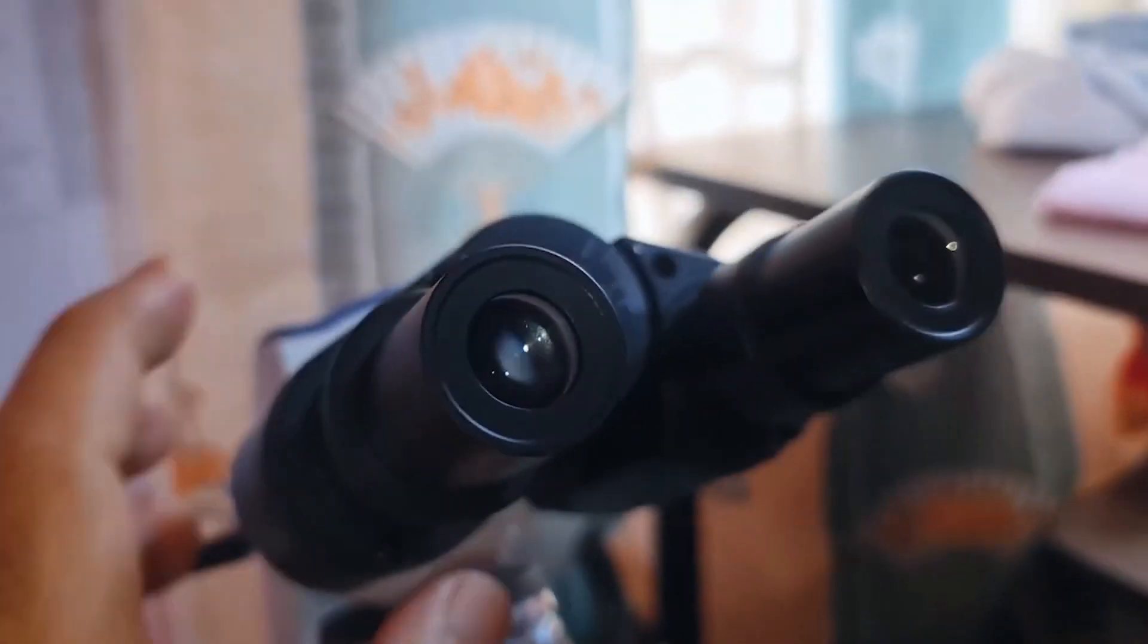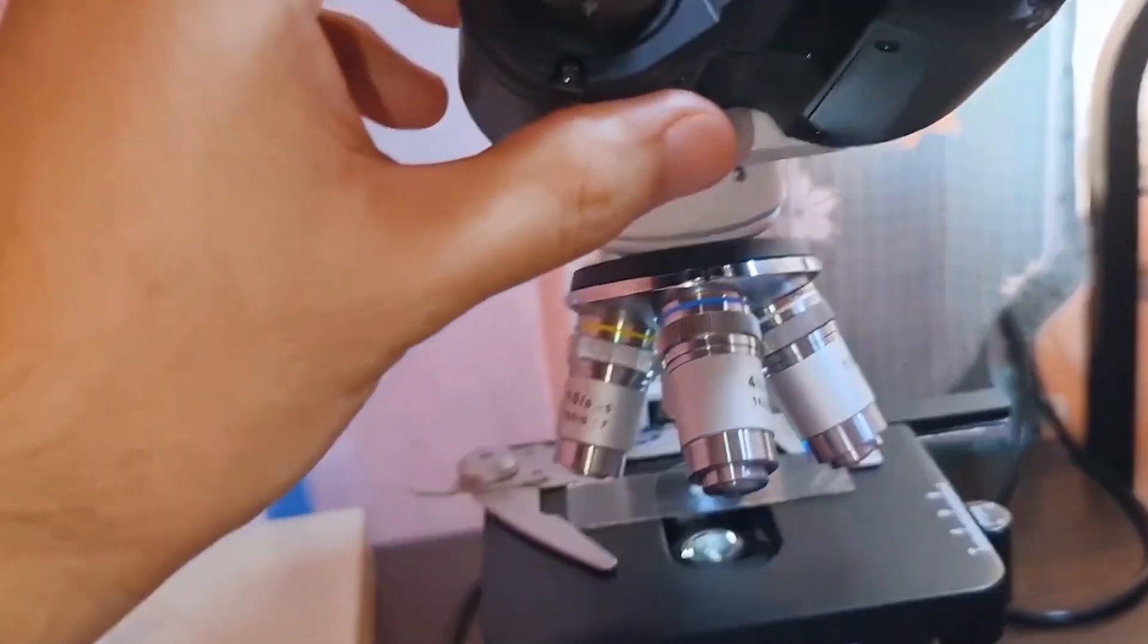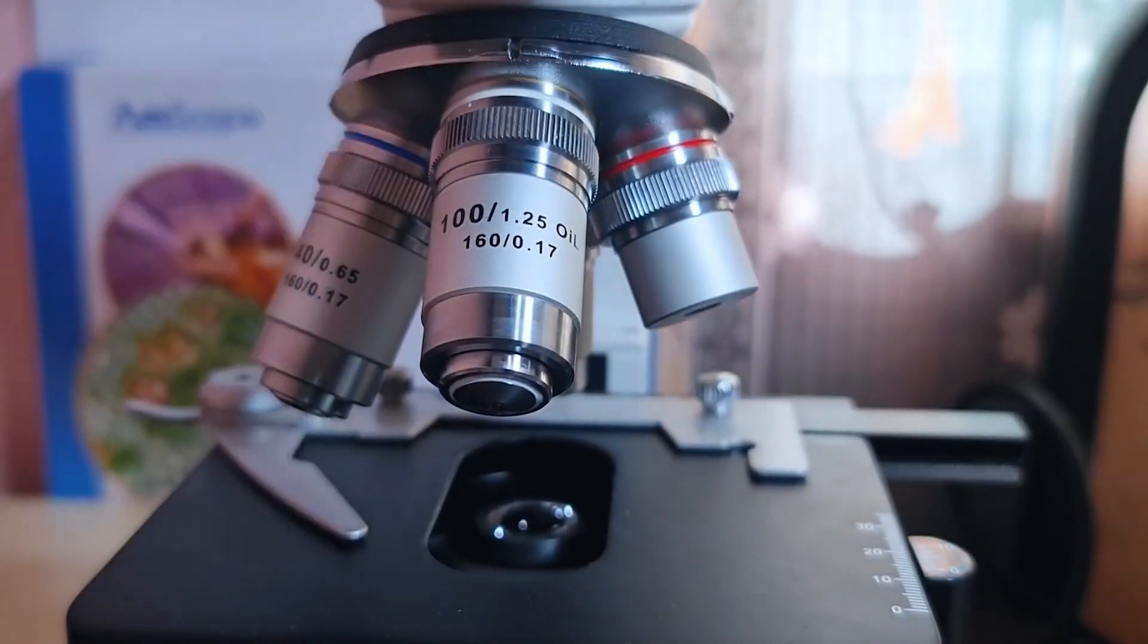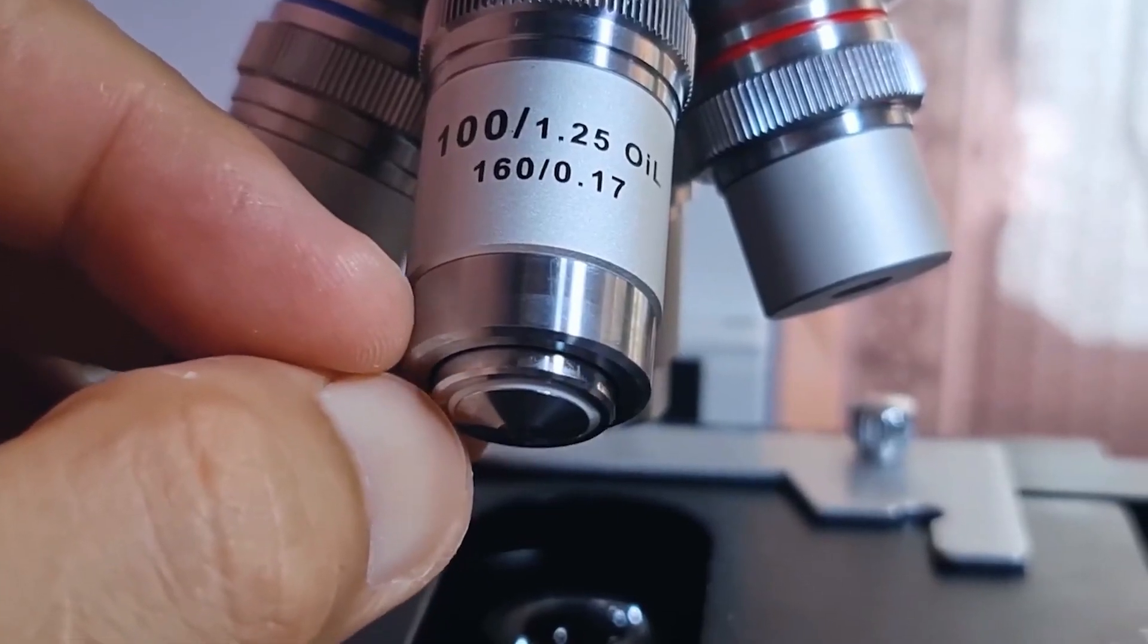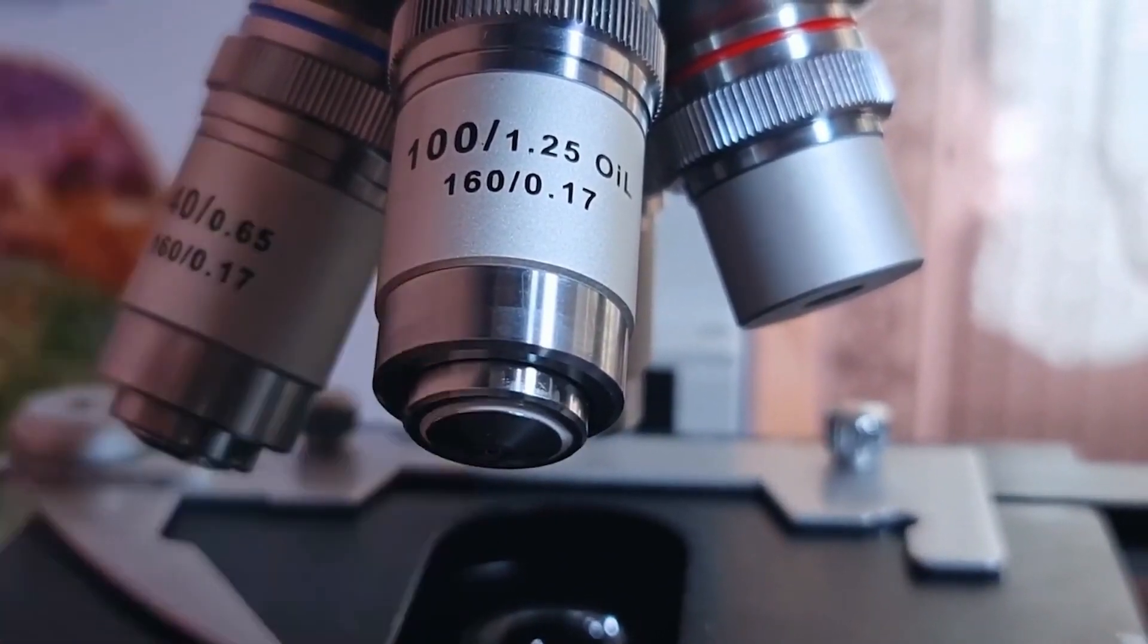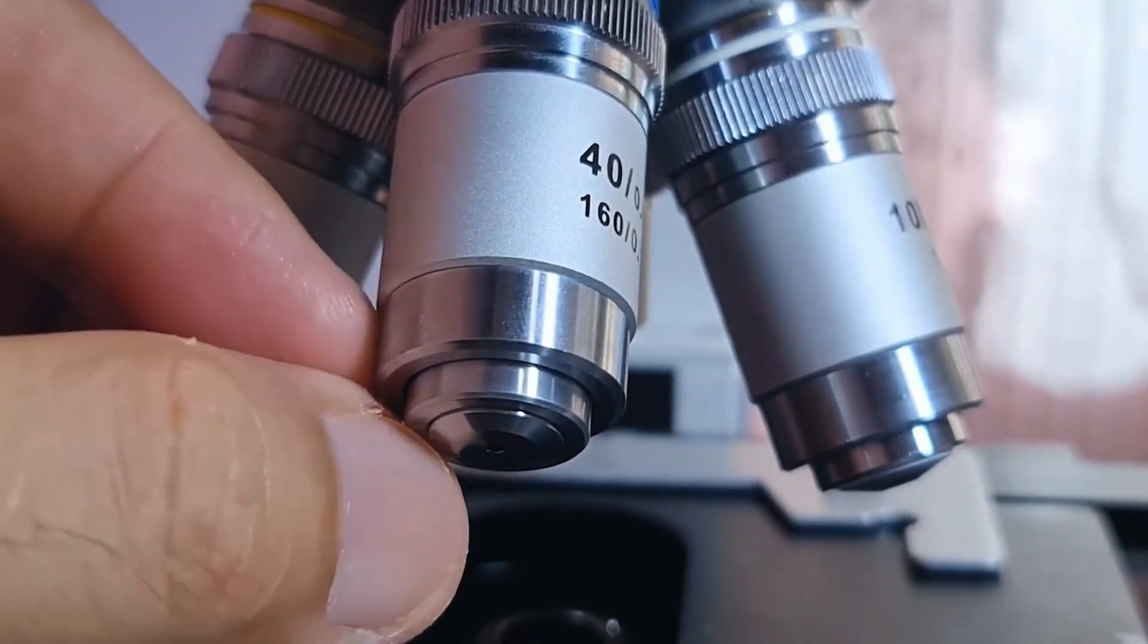At the heart of this microscope is a forward-facing nose piece that holds 4 DIN achromatic objectives: 4x, 10x, 40x spring, and 100x spring oil. These objectives provide excellent color correction, ensuring that your magnified images are clear and true to life, available at 5 different magnifications.